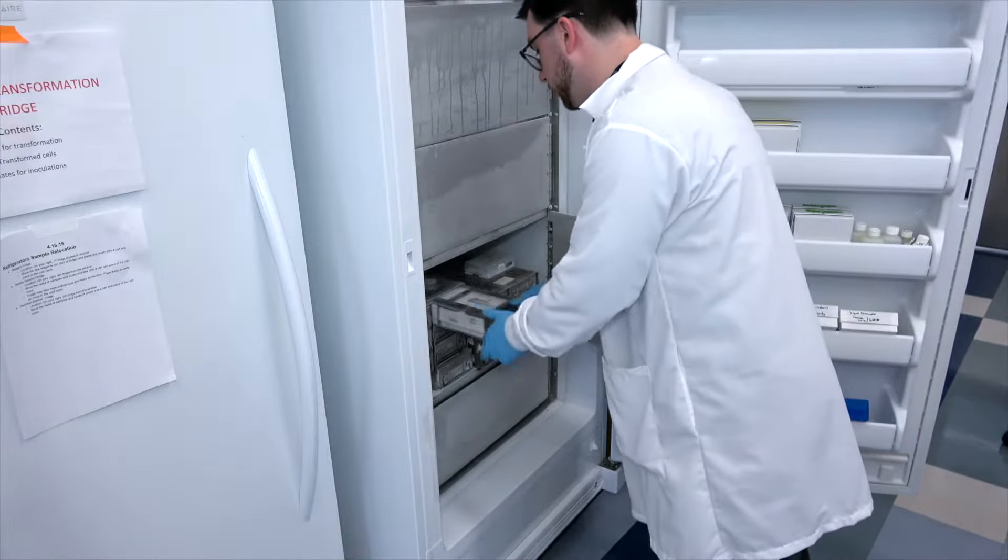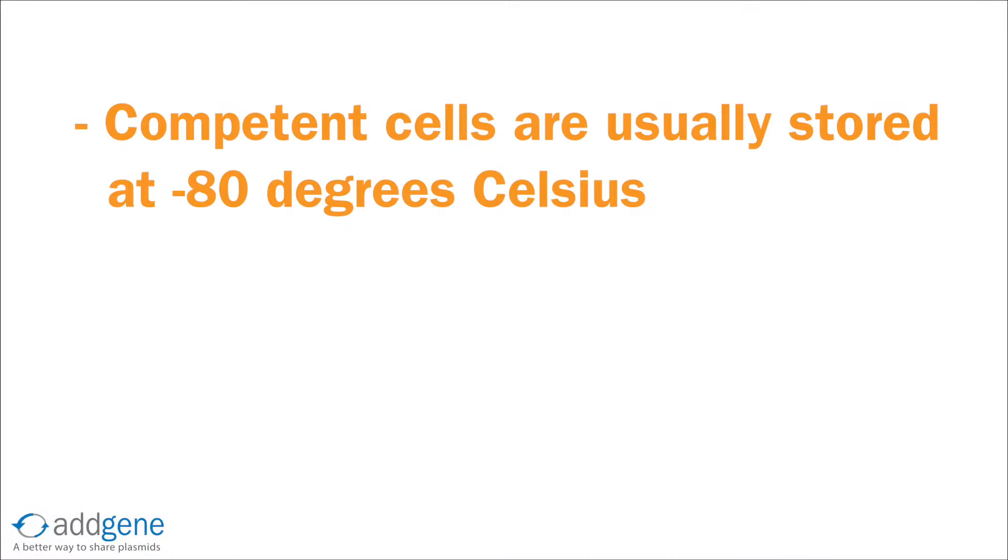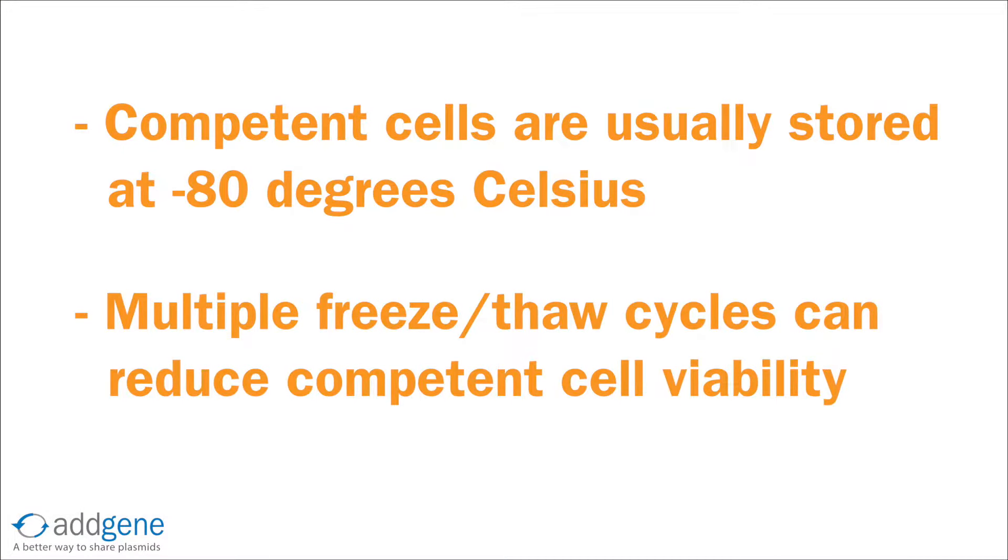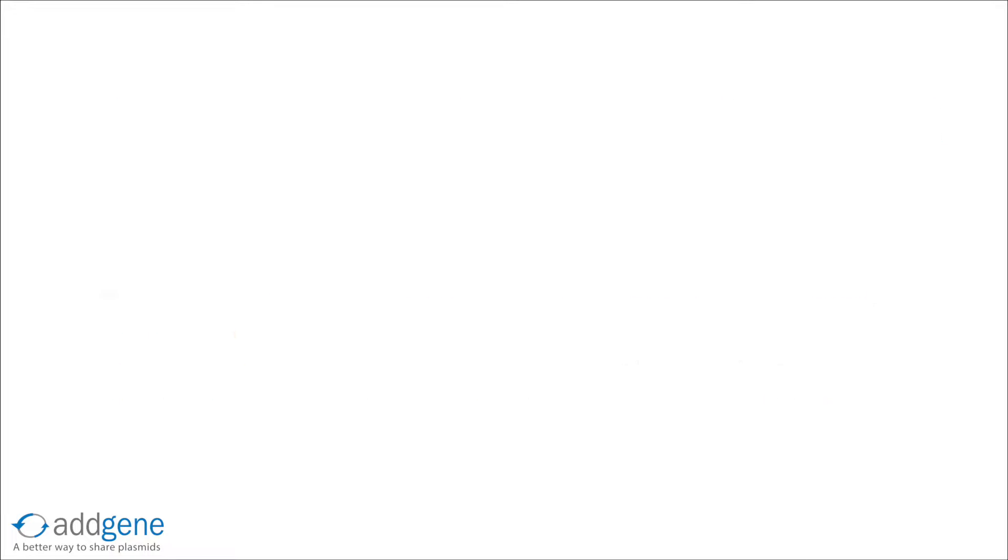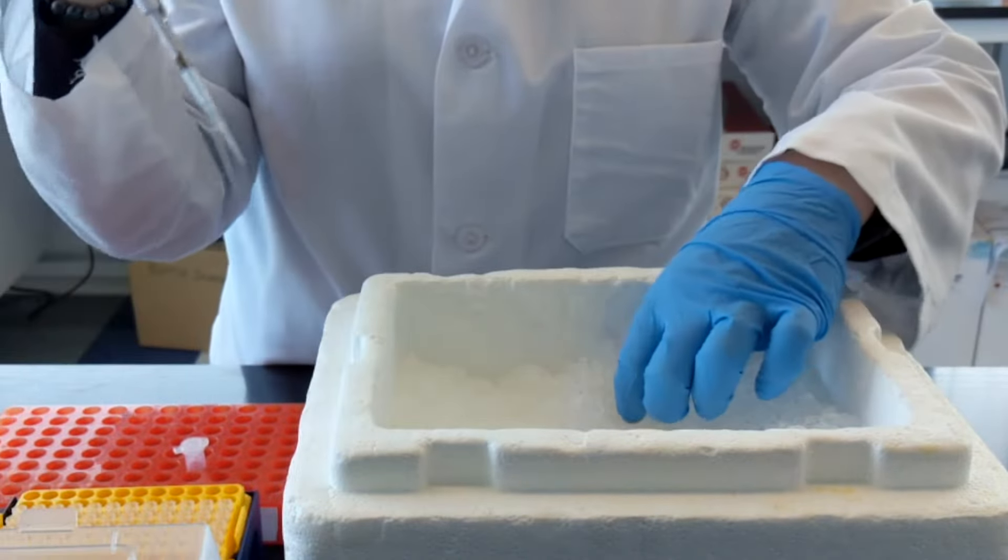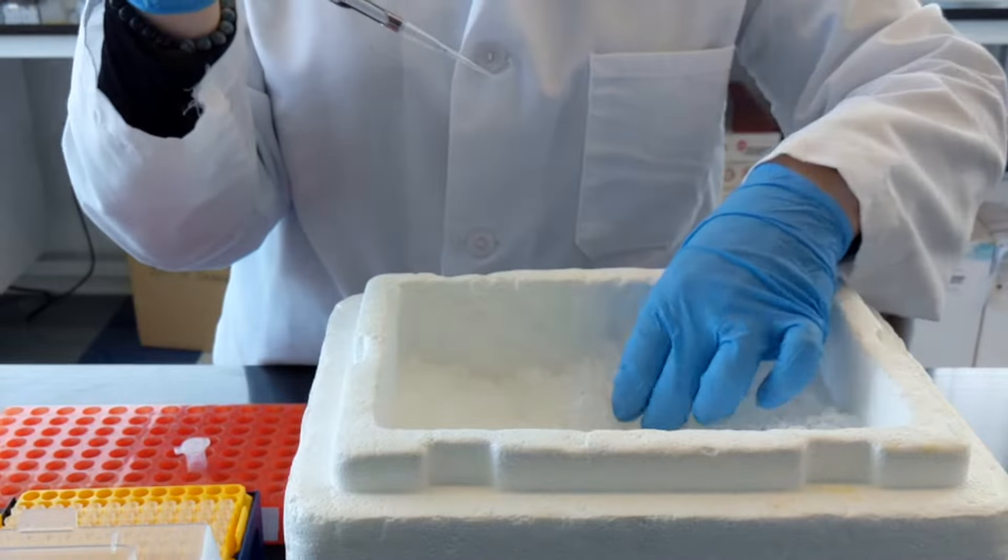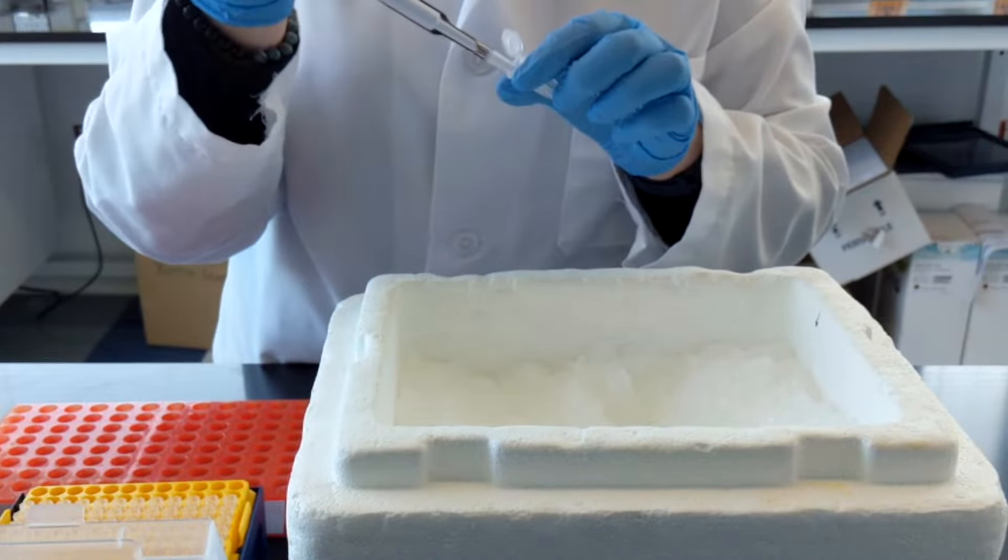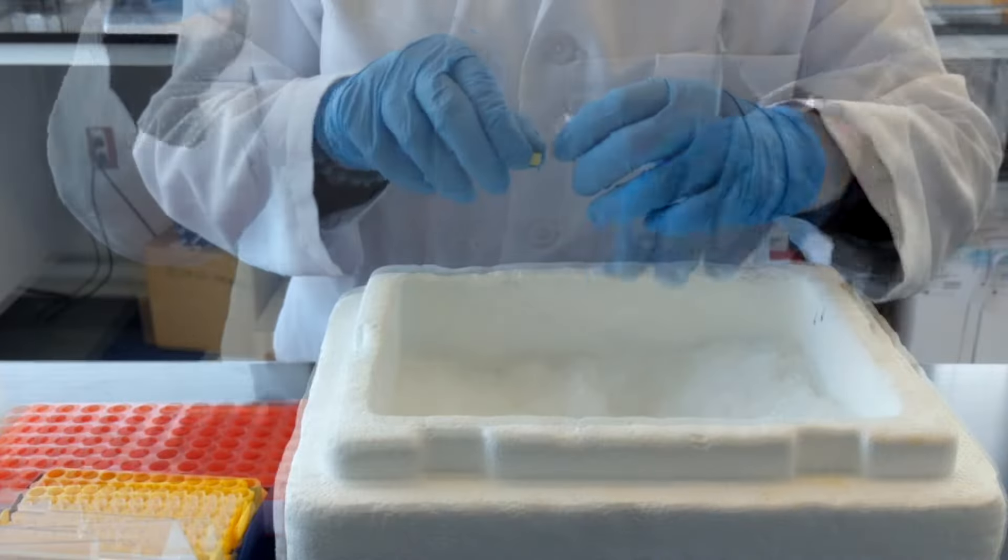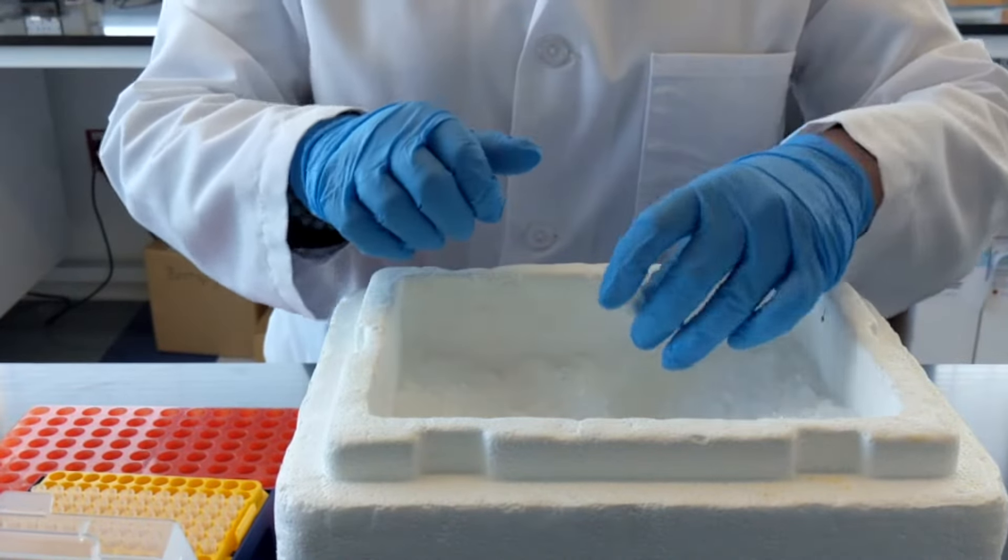Once acquired, competent cells are usually stored at negative 80 degrees Celsius. Multiple freeze-thaw cycles can reduce competent cell viability. To limit competent cell exposure to multiple freeze-thaw cycles, you should aliquot your cells into small volumes prior to storage and only thaw the amount required for your experiment directly prior to performing your transformation.